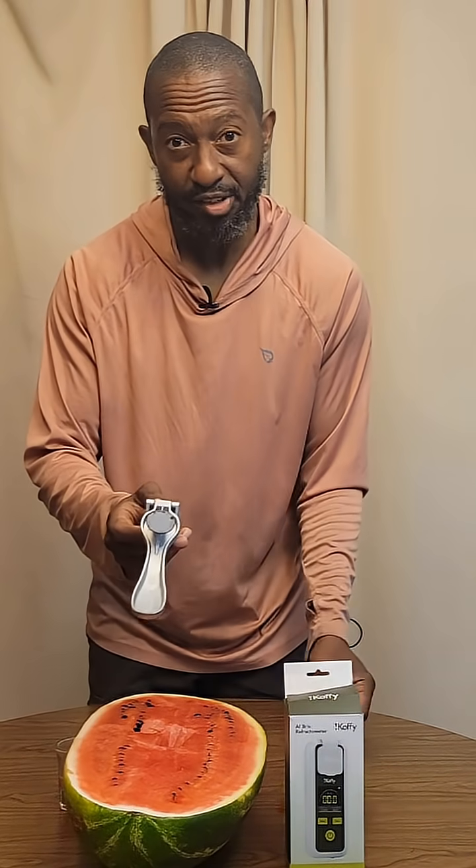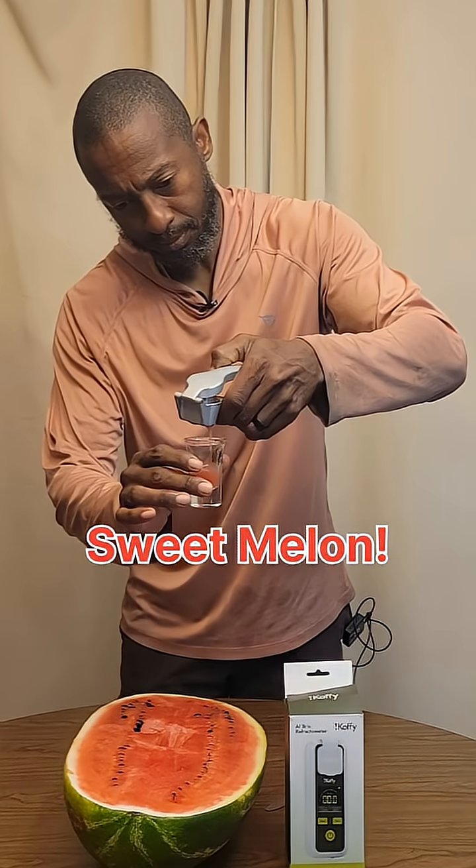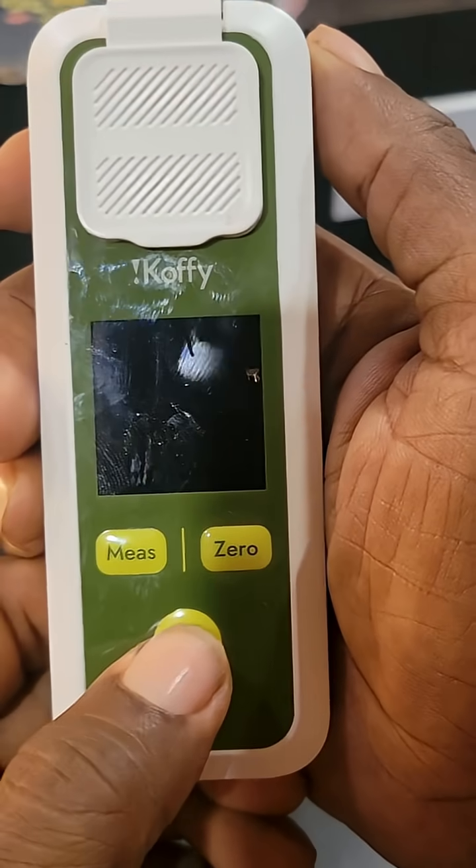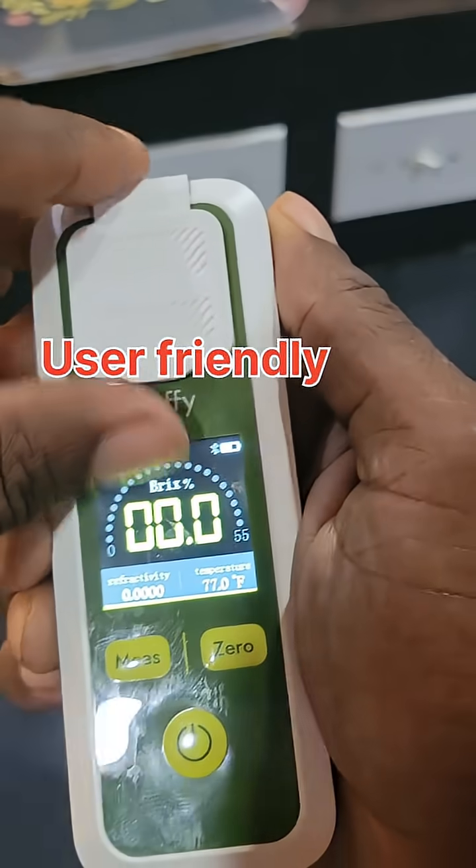Step one: take a sample of the fruit and squeeze the juice out. Step two: turn on the AI Brix Refractometer from iKoffy and open the lid.